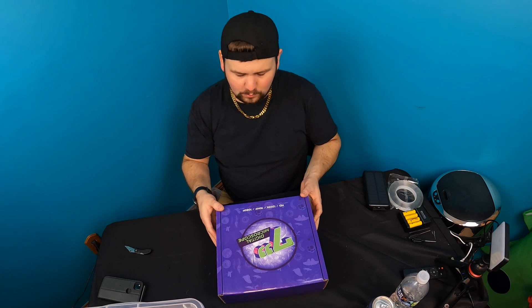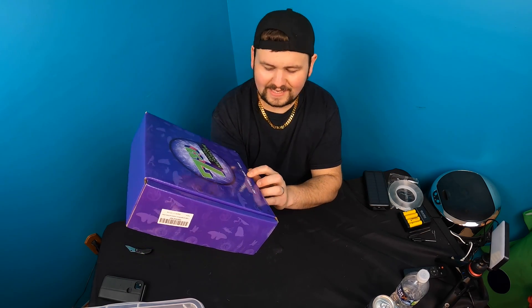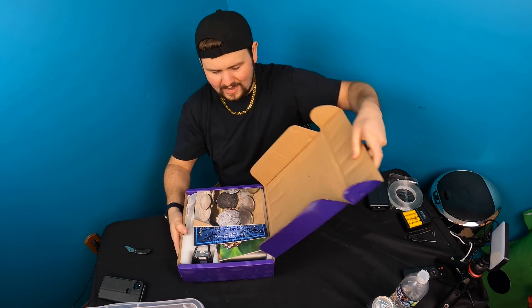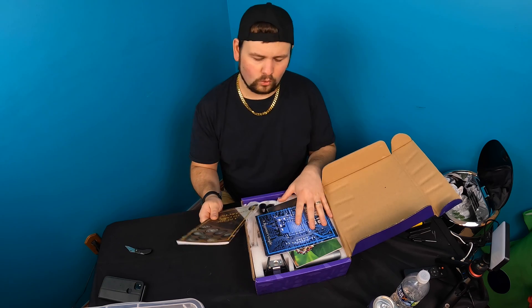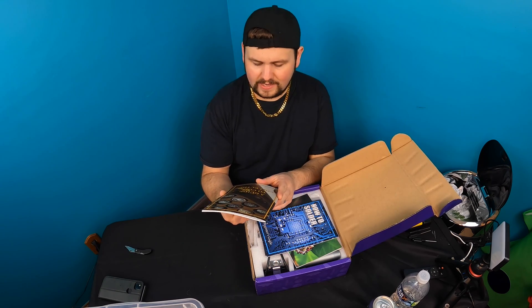Hello my friends and welcome back to another unboxing video. Today we're checking out the HD 1200x 16MP 1080 digital microscope. Let's get unboxing and see what we get. It feels heavy duty — very good quality. Normally the cheaper ones are really lightweight.